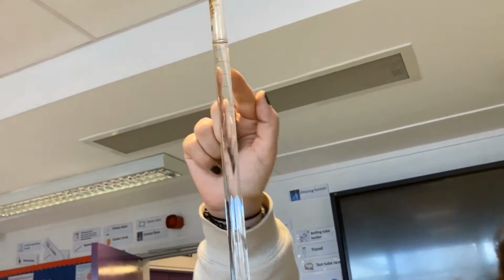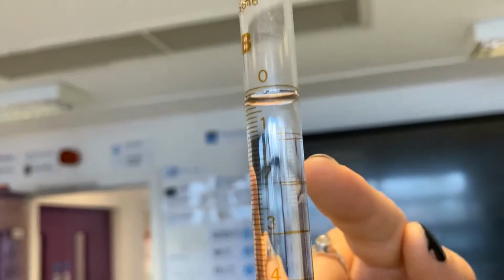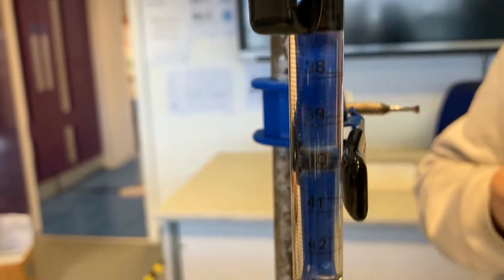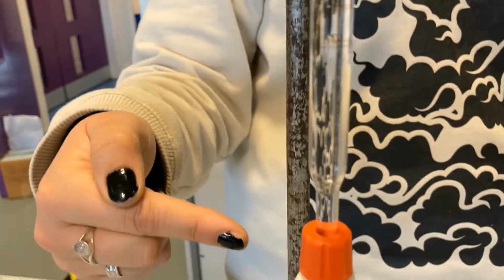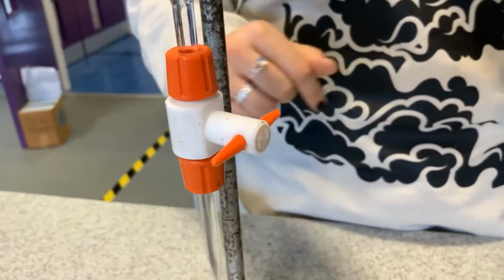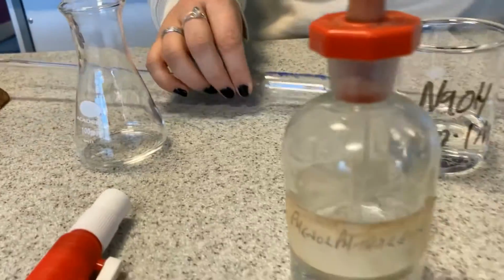If you zoom in really close though, you can see there are graduations along the burette. If you zoom down, you can see we start at 0, and then as we go down, more and more and more, kind of like a measuring cylinder, but it's got a tap at the bottom, okay, which is really useful and super important.